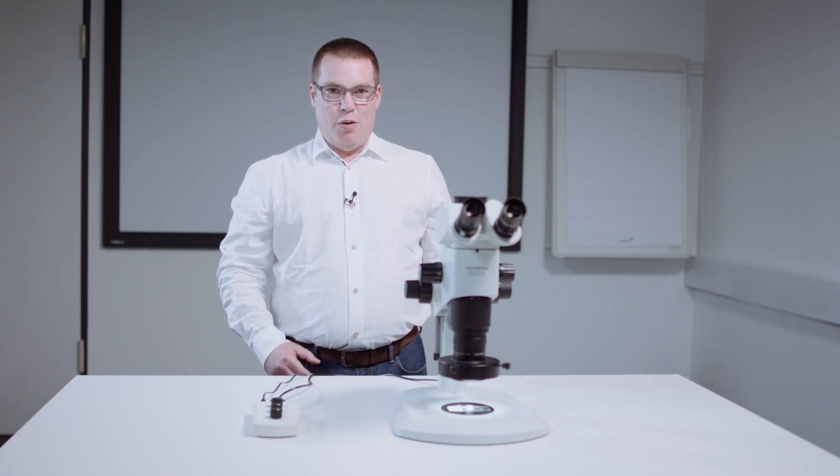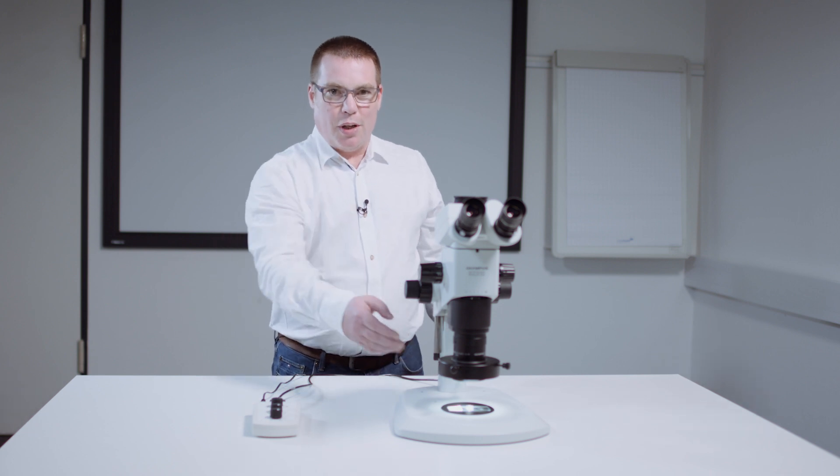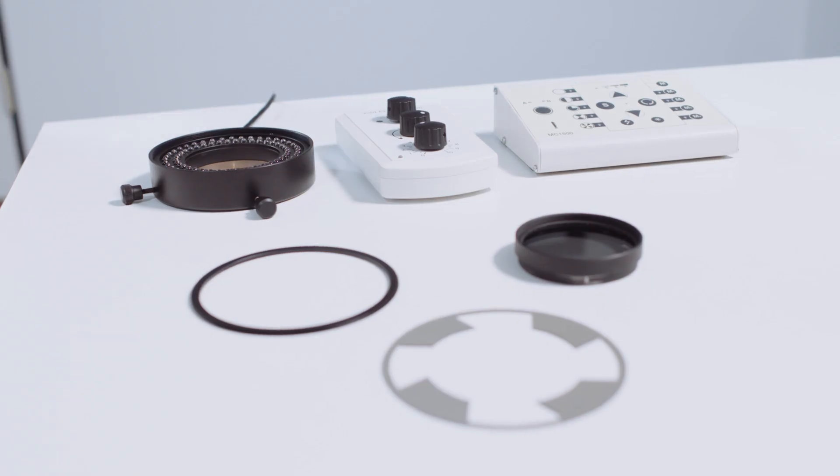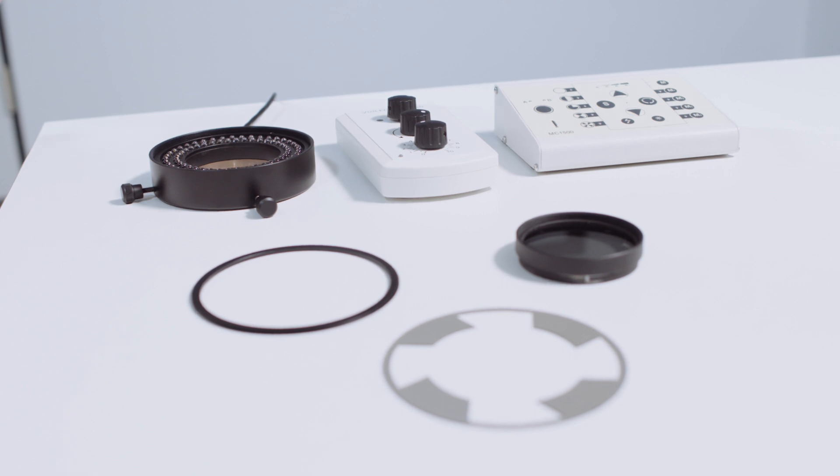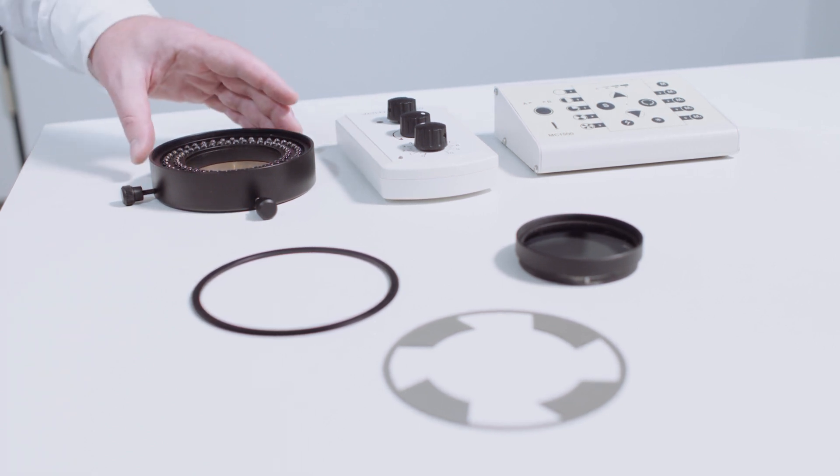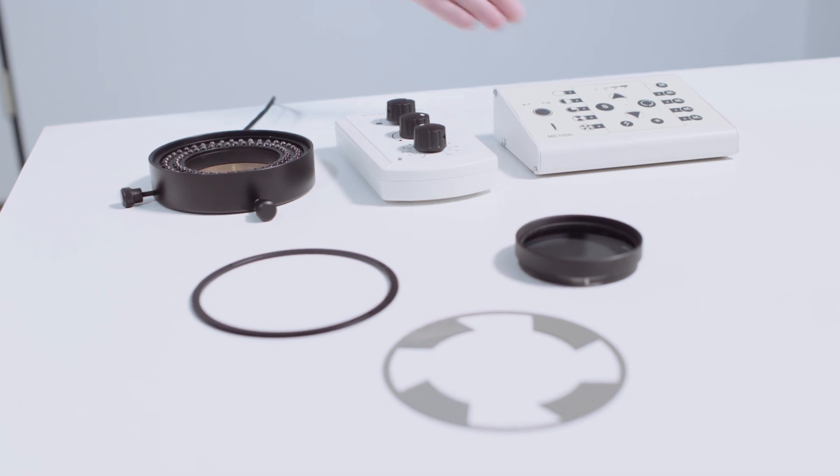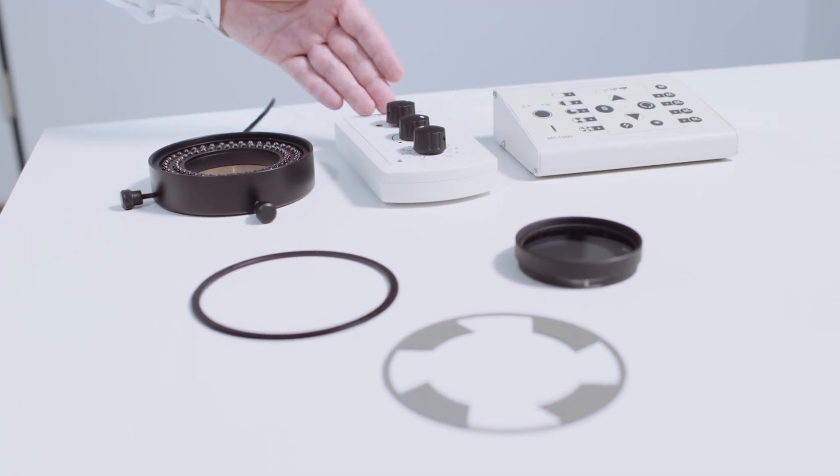Today I would like to introduce you to contrasting using our segmented polarizer set. This set for segmented polarization is designed for a VZLED ring light S8055 in combination with the MC1500 or MC1100 controllers.